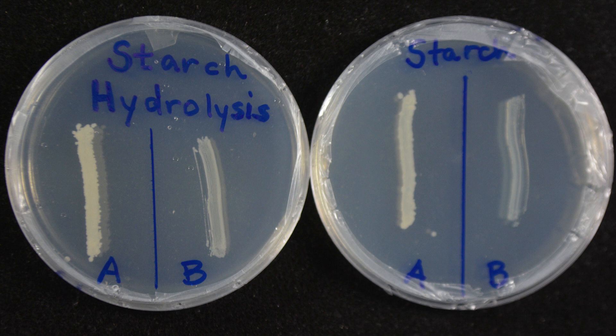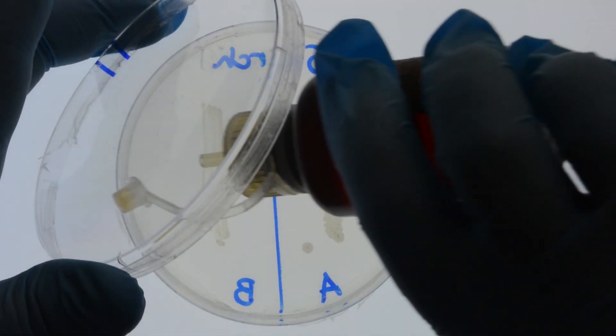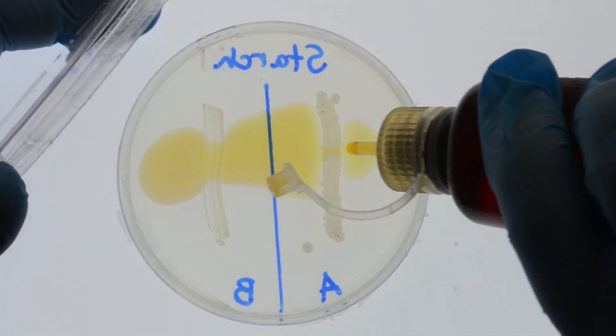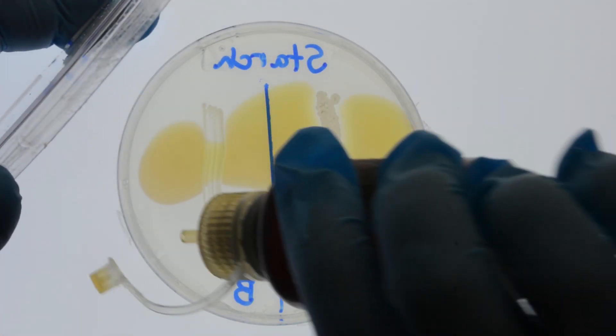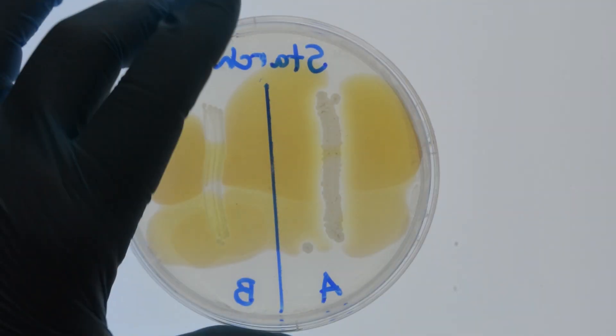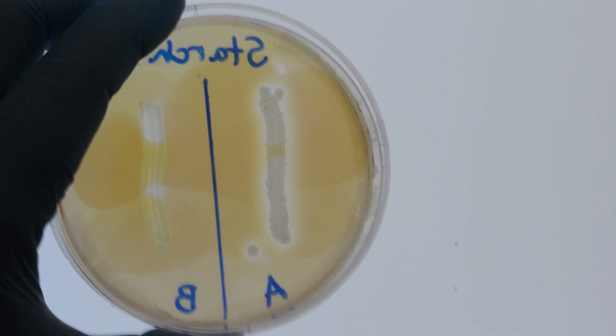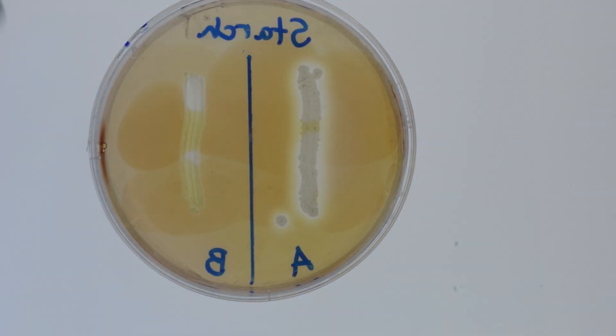First, remove the lid from the plate. Then, take the iodine solution and put drops across the culture or flood the plate in a thin layer. When the iodine is placed on starch, it reacts with the starch. That complex will show a color change on the agar, in the range of a reddish brown to a purplish color.